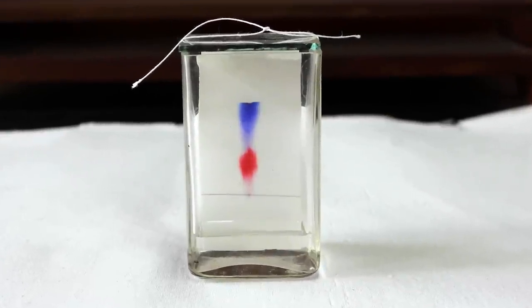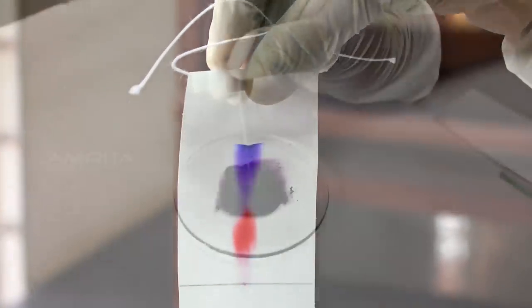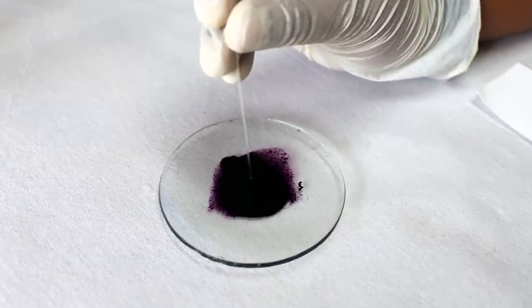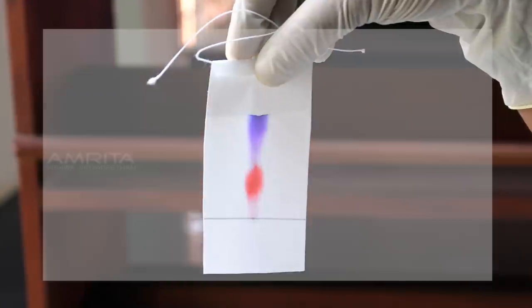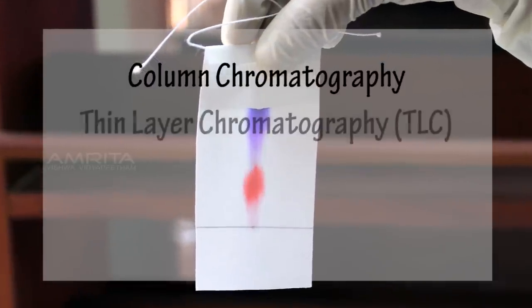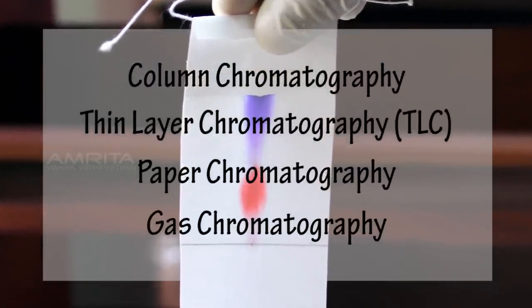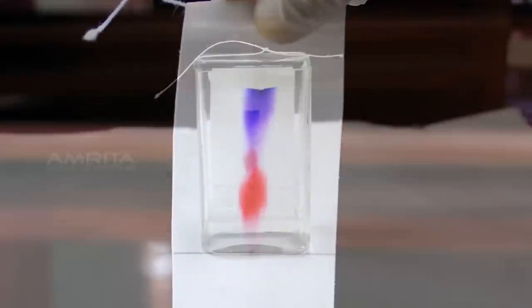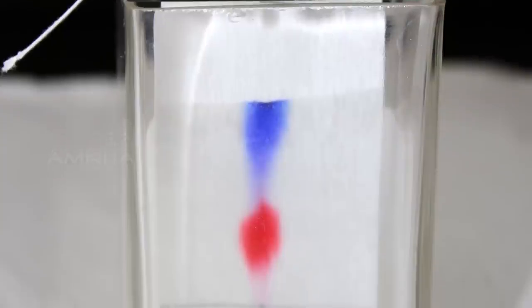Chromatography is a separation technique used to separate the different components in a liquid mixture. There are different types of chromatographic techniques such as column chromatography, TLC, paper chromatography, and gas chromatography. Paper chromatography is one of the important chromatographic methods.